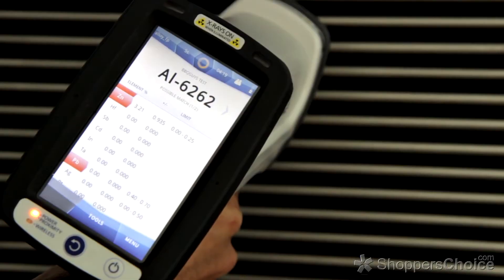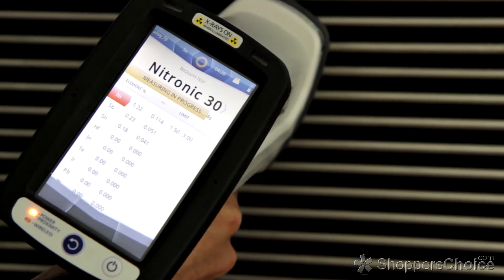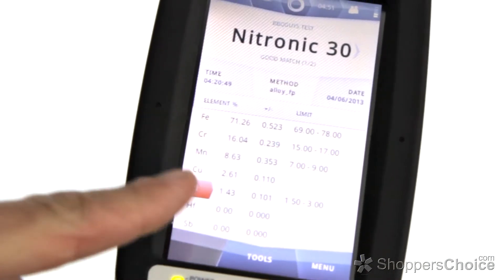By pressing its sensor against an item, in about 5-6 seconds it will analyze and make positive identification of the alloy used and the percentage of the different elements within the alloy. It then gives back a full report that we share with you in video.